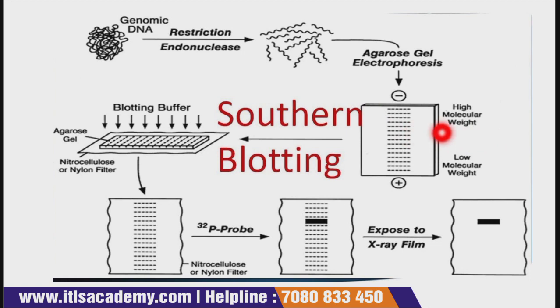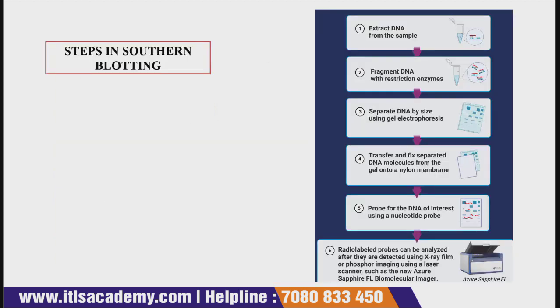On the negative side the upper bands are high molecular weight, and on the positive side they have low molecular weight. Then you put it into the blotting buffer, which has the agarose gel and the plate, that is nitrocellulose or nylon membrane. Then they have a probe on the nitrocellulose or nylon filter, the step that we studied in step 5.